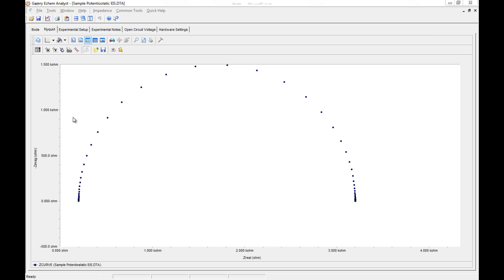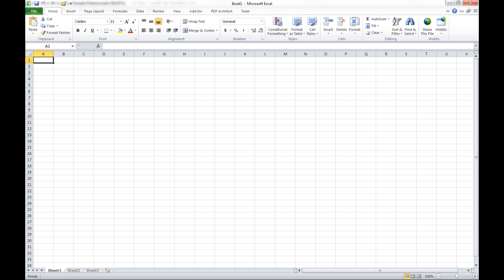Then it's very easy to paste XY data into a program like Excel or Origin or Sigmaplot or any other graphing program you might have.